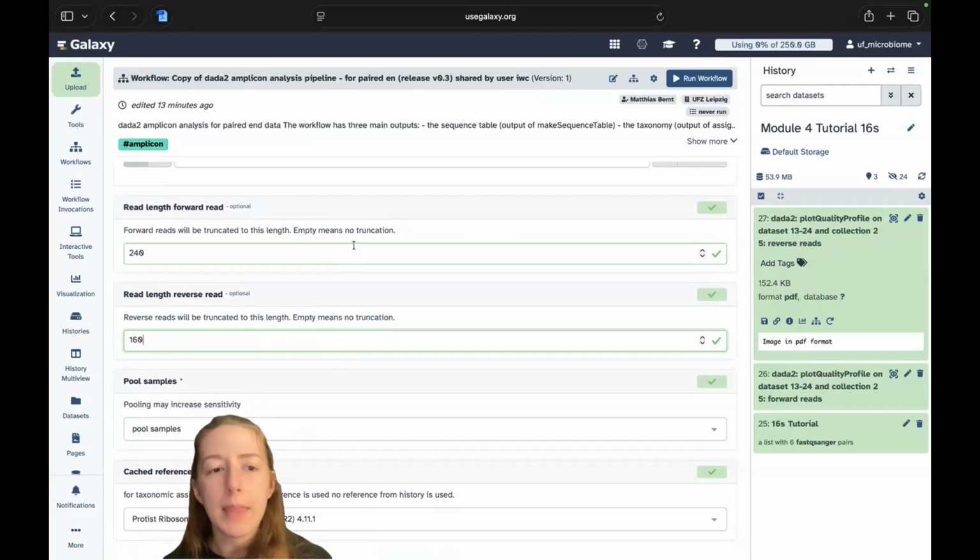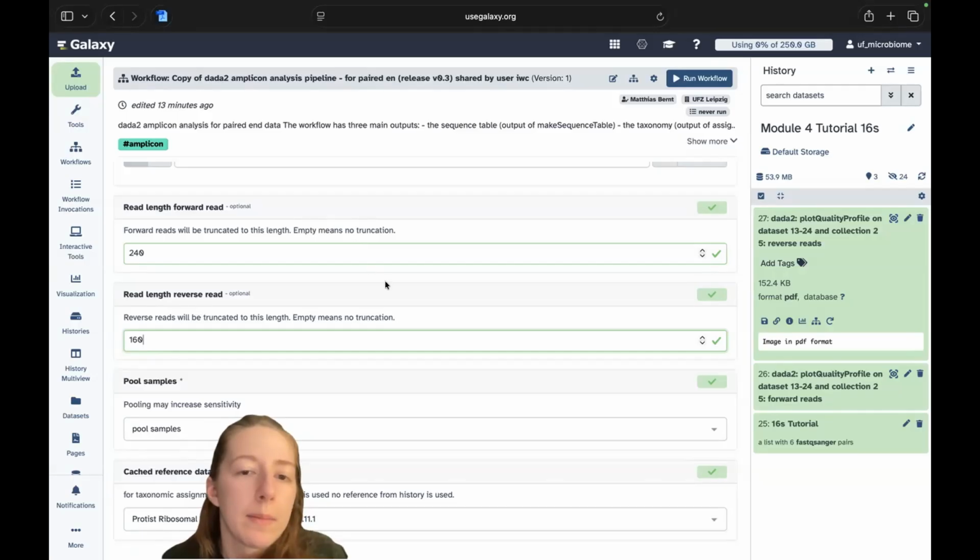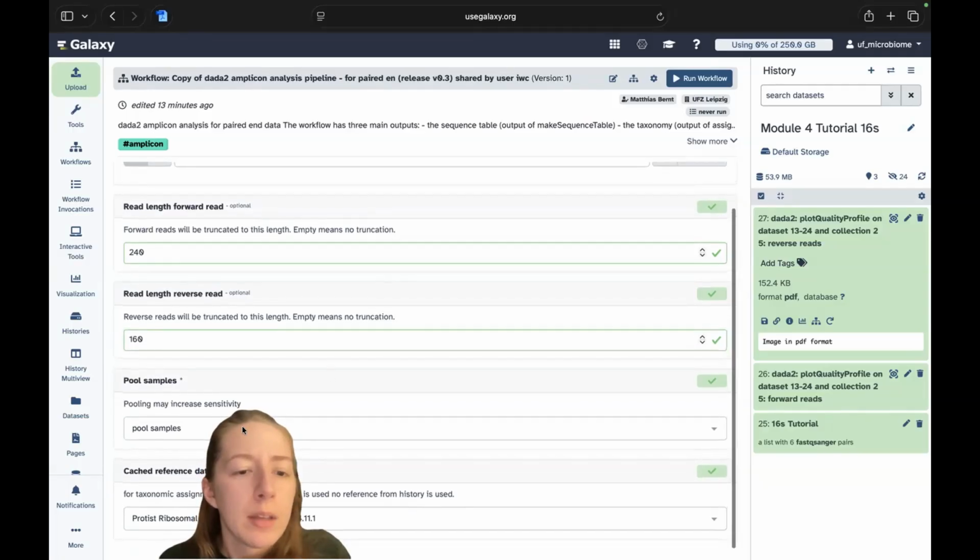I think in our case, if we wanted to trim more, the quality wouldn't really be more preserved, and we could potentially mess up with overlap and alignment. This, in the end, will result in potentially less ASVs being recognized and less depth in our analysis because many reads might have to be thrown away if they can't merge properly.